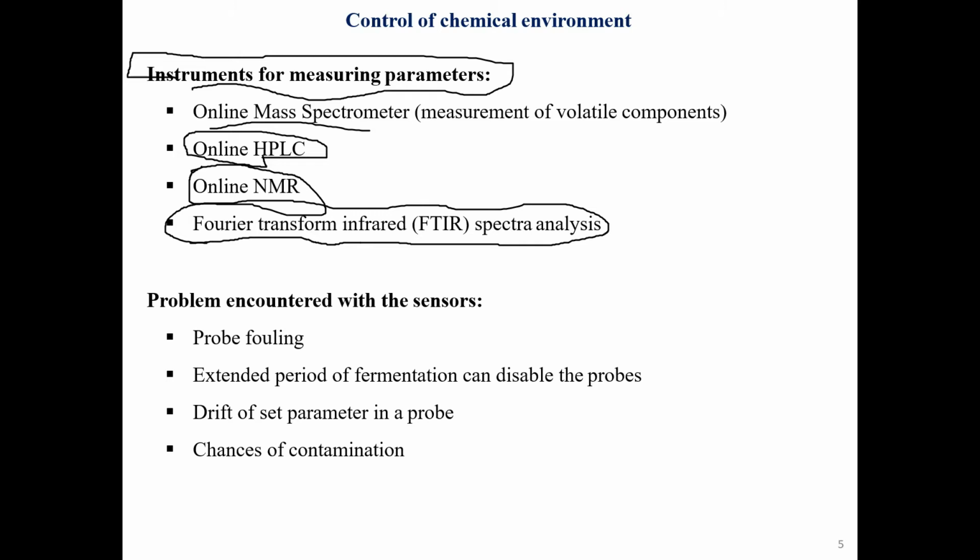There are some problems that people have encountered with the use of these instruments. Some of these are fouling, pardon.